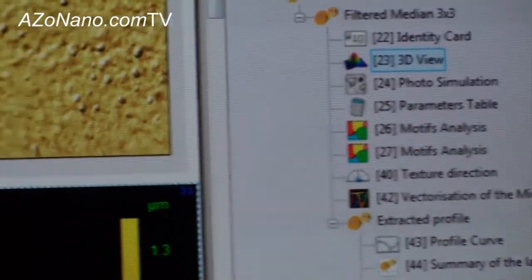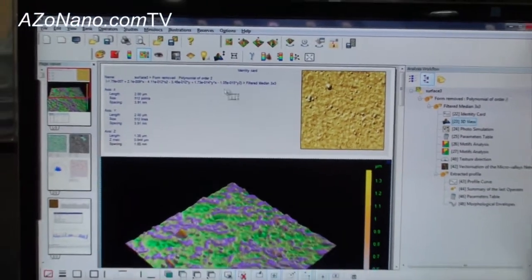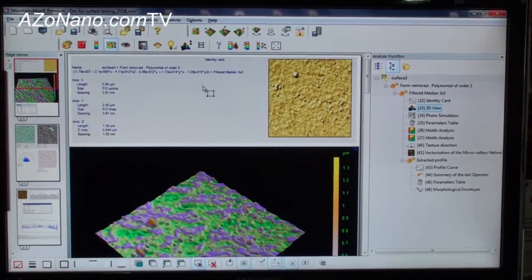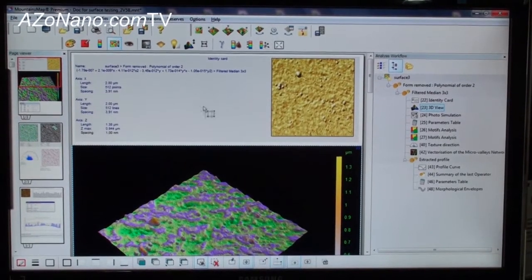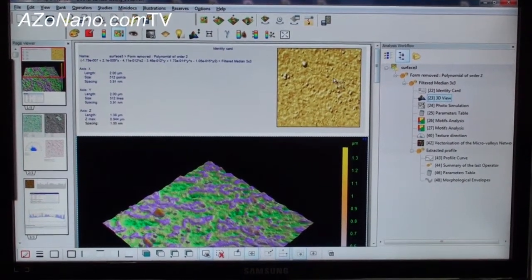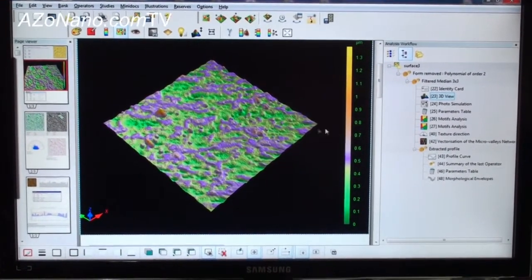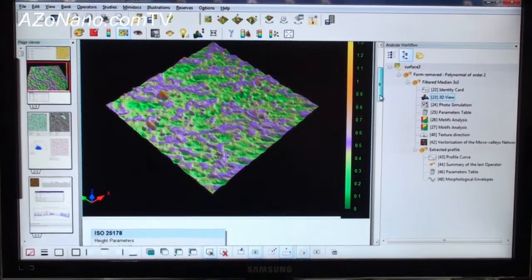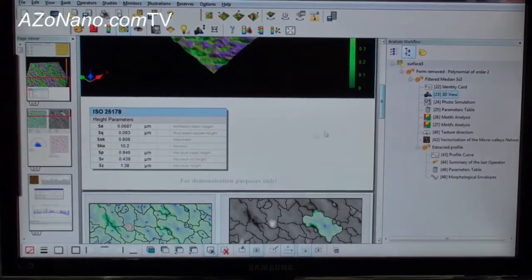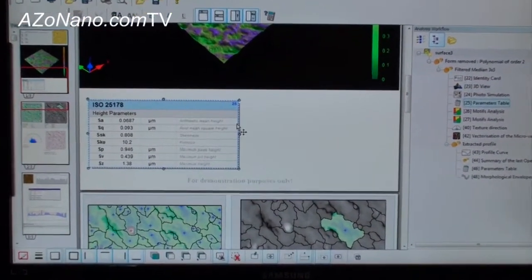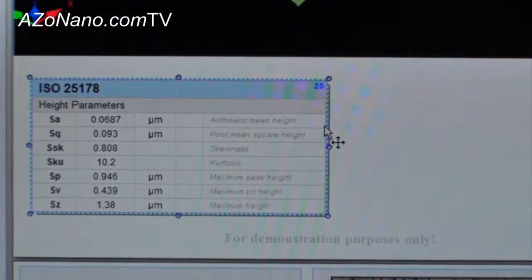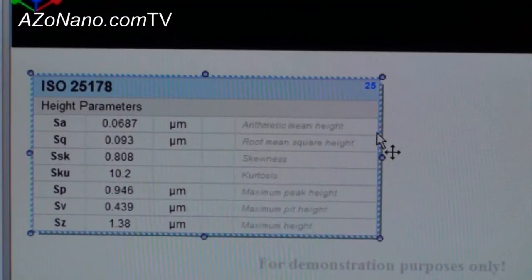So let me show you the beginning of the document. This is some information about the measurement itself. You have the resolution, the top view of the surface. Again, you have the 3D view of the surface. And you have some parameters about the surface texture from the surface.